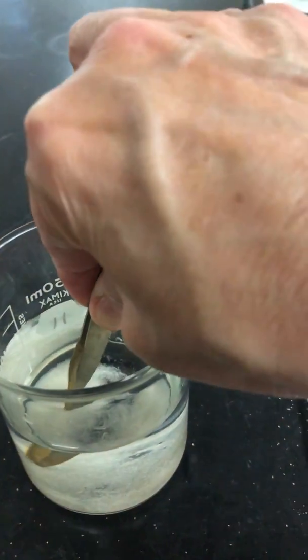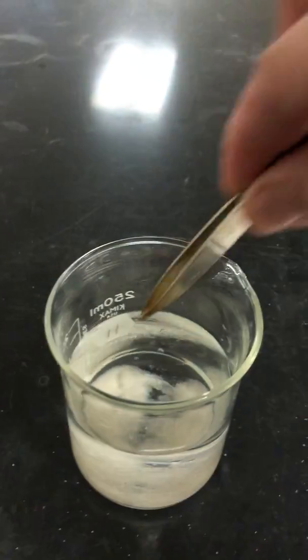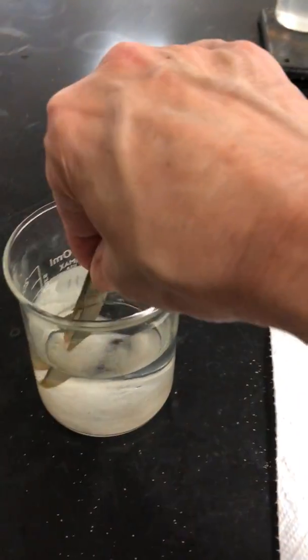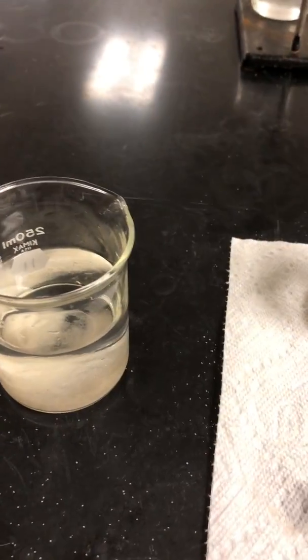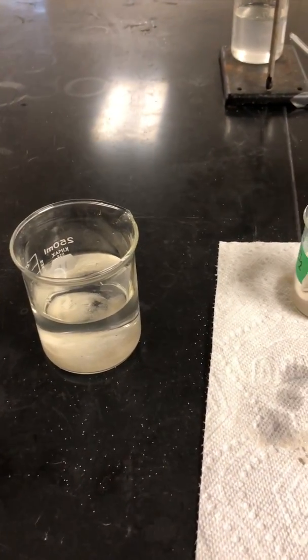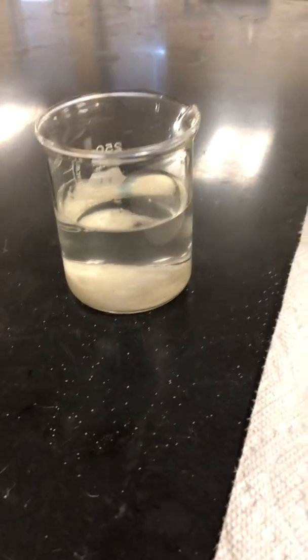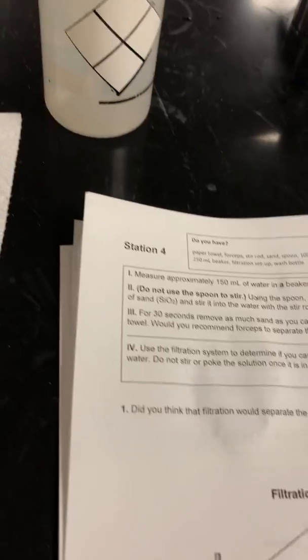All right, so for 30 seconds, you're like, okay, one at a time. And I had students say, Ms. J, do we really have to do this for 30 seconds? This is horrible. I said, no, good job. It says, would you recommend forceps to separate this mixture and why? You decide. Okay, I know what I think. Use the filtration system to see if you can separate the sand from the water.